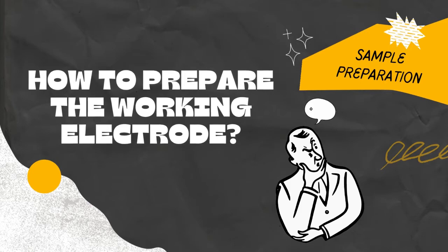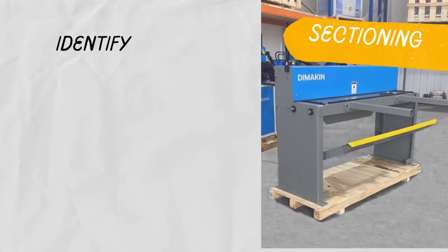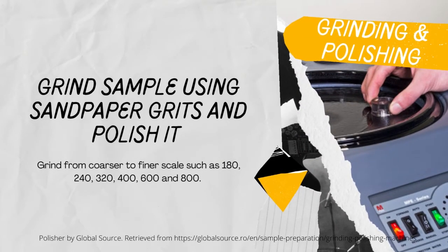Okay, now let us see how we are going to prepare the sample for the working electrode. Firstly, a target sample is chosen for investigation and needs to be cut to 2 by 2 cm in dimension. The sample then needs to undergo grinding and polishing processes in order to produce a smooth surface that aids visibility of the outcome that we want.